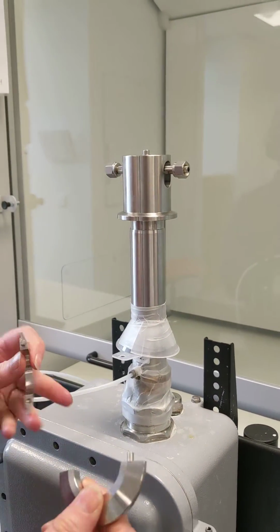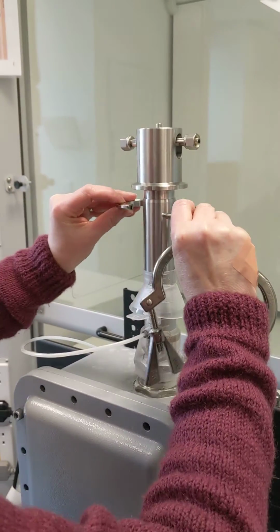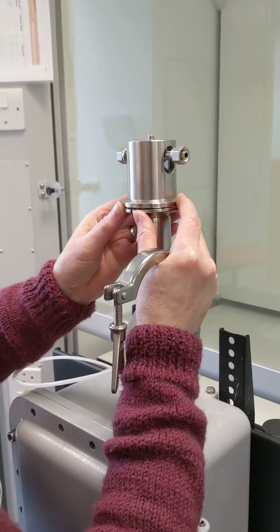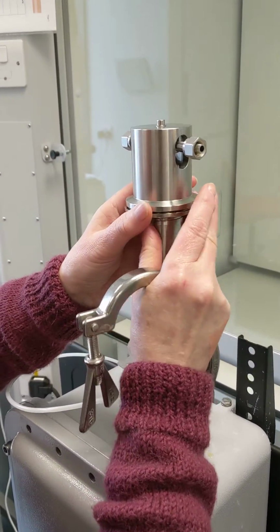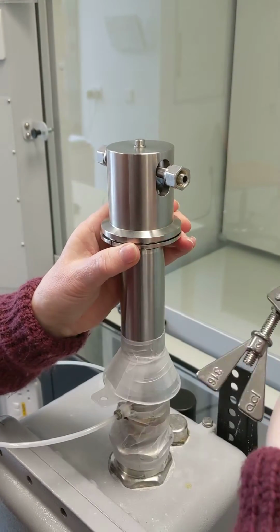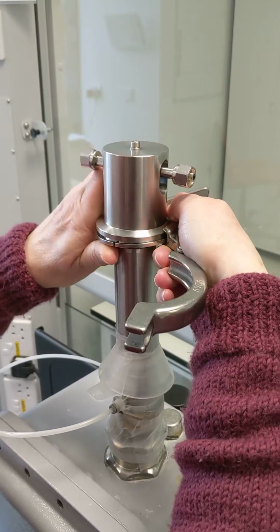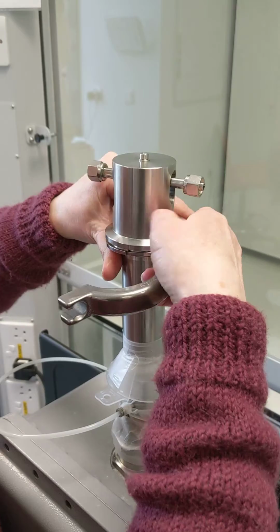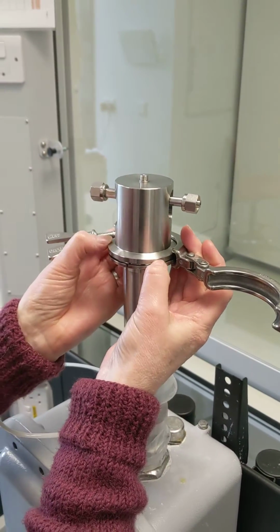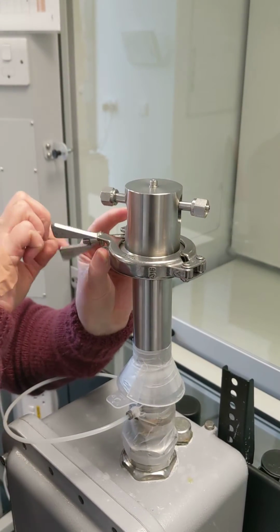You then use your, we call these C-clamps. Okay, so the flat side goes against the flow cell, like so. If you're doing this the other way, sideways on, these will stay easier. Then you fit the whole, oops. So you fit it so that there's C-clamp and the edges of low flow cells in there. Close it.